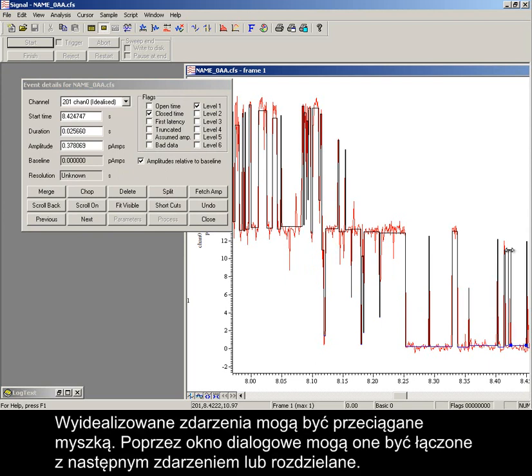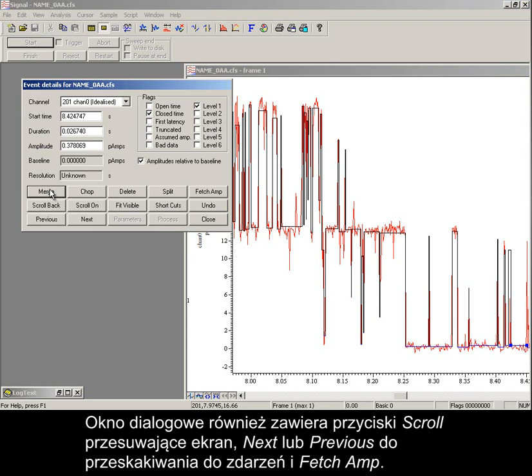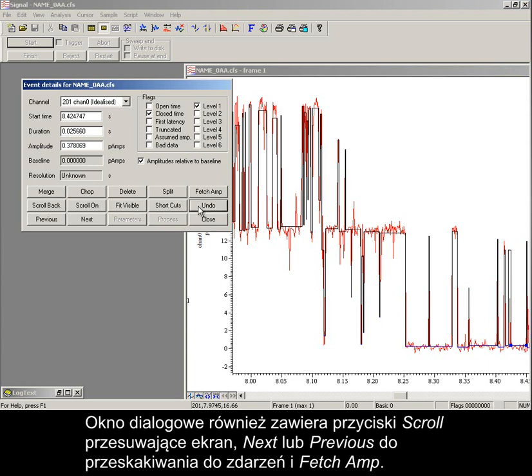The idealized events can be dragged with the mouse. They can also be merged with the next event, or split, using the dialog. The dialog also contains buttons to scroll the screen, to jump to the next or previous event, and to fetch AMP. This scans backwards to find an event of the same type, and copy the amplitude of this previous event to the current event.